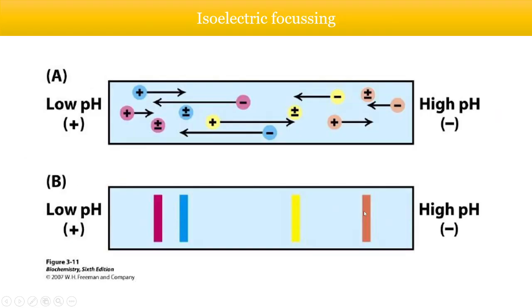Great. So another thing is isoelectric focusing. All of these techniques have been discussed previously. As you can understand from the name, isoelectric focusing separates proteins based on the isoelectric point of that particular protein.